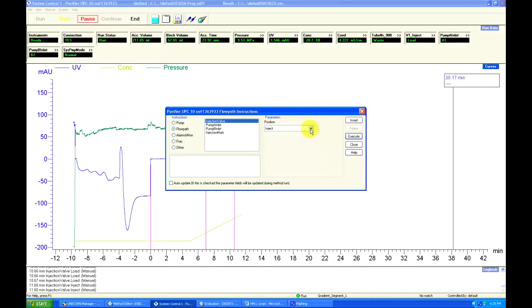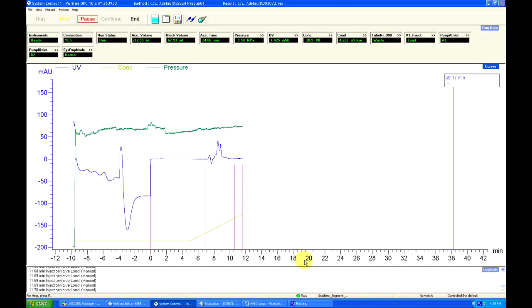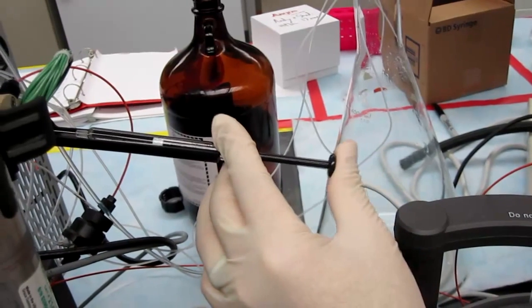Once the needle is attached, we can change the parameter back to Load. Make sure to click once or even multiple times on the Execute button to ensure you have an airtight seal between the needle and the injection valve. Then, we can inject our sample.